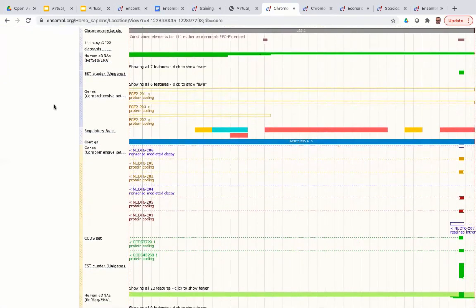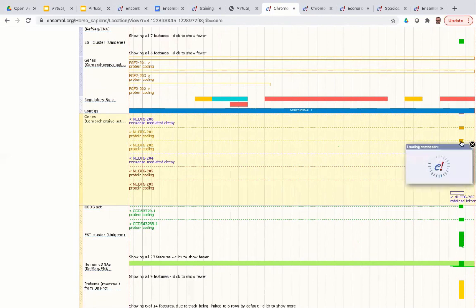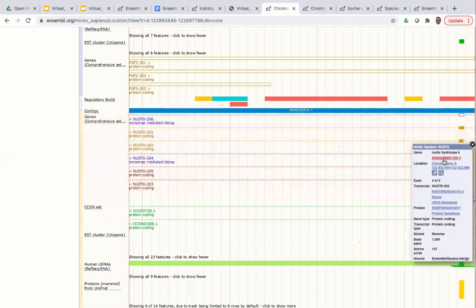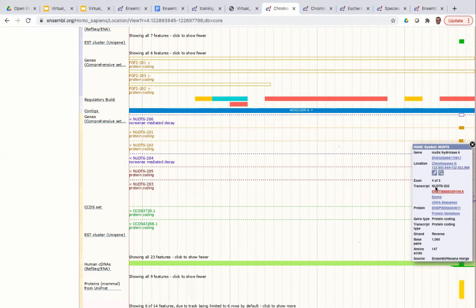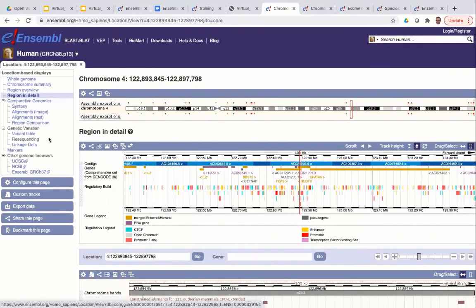The final thing to mention is that everything within this view is clickable. If you're interested in something, the best thing to do is click on it. For example, clicking on an exon of NUDT6 gives a pop-up window with more information — links to the gene, to the genomic location, to the transcripts and exons, to the protein, and further information. We're going to explore some of these links later on in the next session.